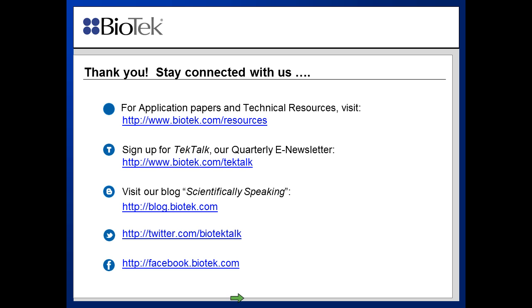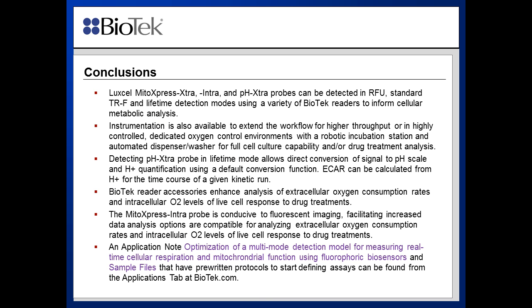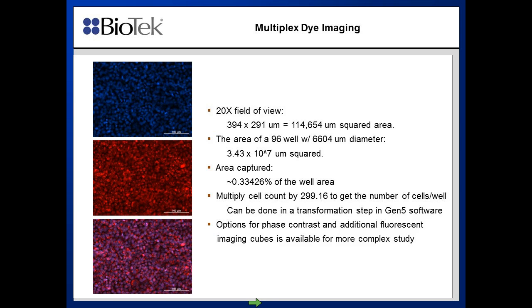And a final question was, can the measurements be done at 5% oxygen? And how sensitive is the system at 5%? The answer is, the lower the oxygen concentration, actually performance goes up. And as you've seen, Wendy has used the Citation 3 at lower oxygen concentrations. So the answer to that question is a short yes.